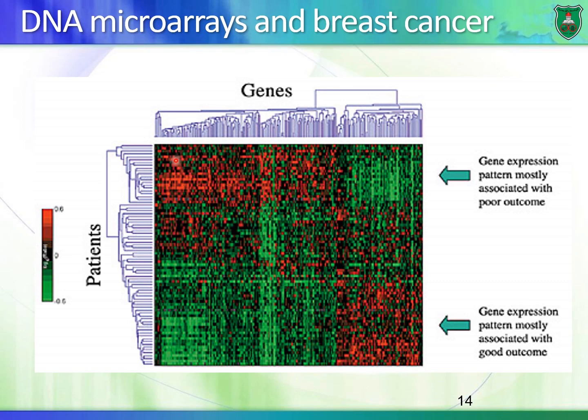For these genes, there's overexpression in these patients and down regulation of these genes in the same patients. Look at the pattern for these patients right here. It's the opposite. There is down regulation in cancer for these particular genes, and there is upregulation of these genes in these patients. So the pattern of gene expression is different among these patients.